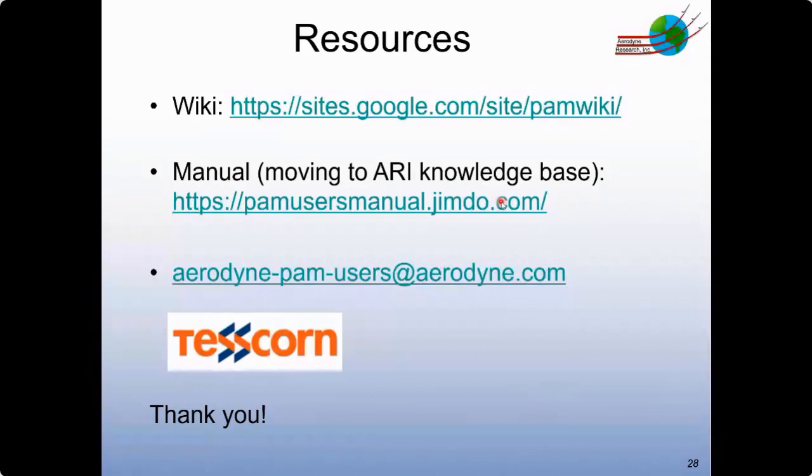So I've worked with a few distributors over the years to deliver OFRs to user groups. For the most part, because the PAM is still a relatively new instrument and those distributors have not had formal training on it, they'll deliver it to the lab, open the box, plug in the cables, demonstrate that it basically turns on, and then leave.